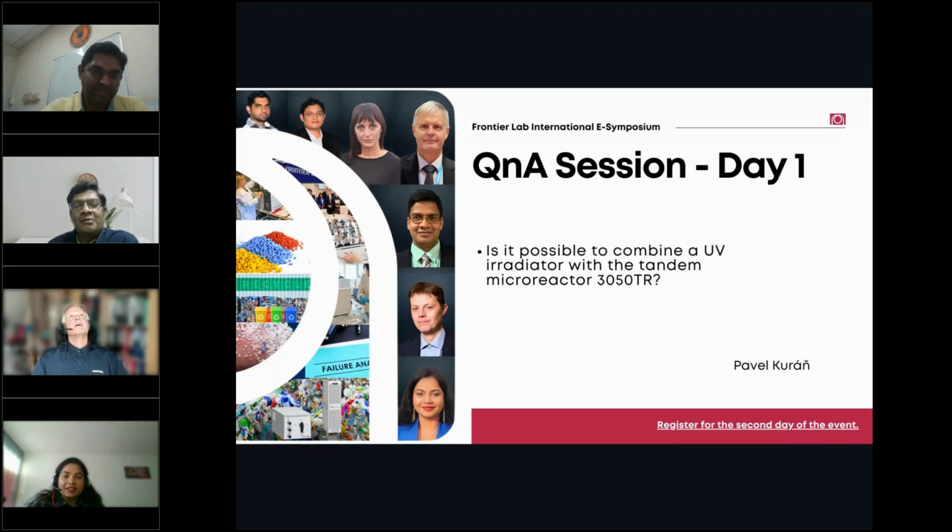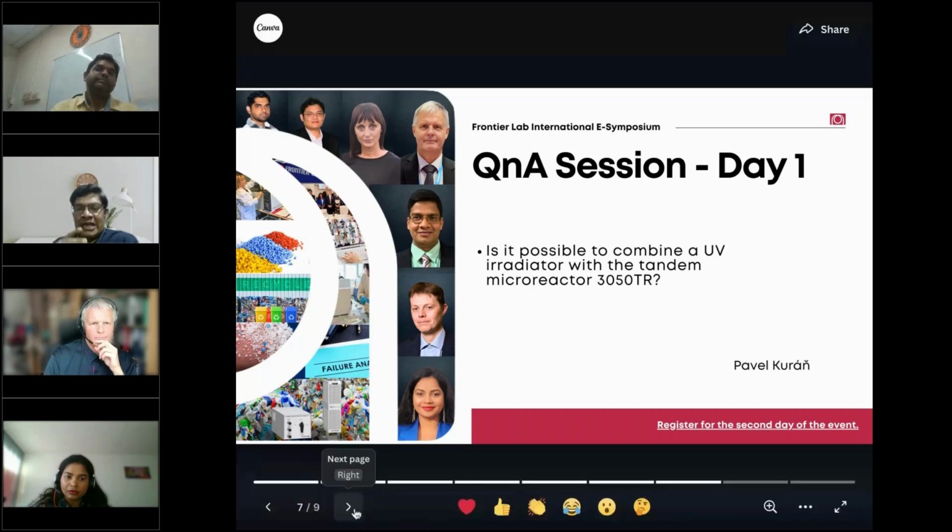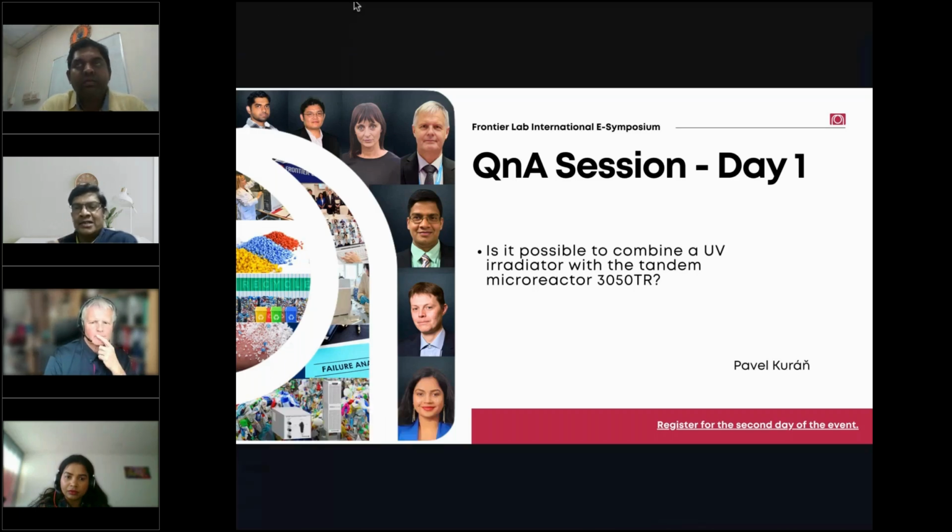I will answer if you don't mind. If the intention is only to use one of the reactors, we have a customer back in India where they are using the tandem reactor as a single reactor, like a PY-GC/MS type. In this case, you have to leave the second reactor empty. But in terms of the performance, we cannot guarantee because there is another reactor, some connections, an interface.